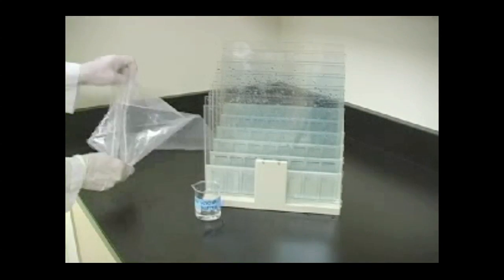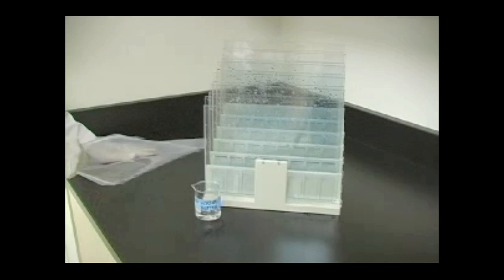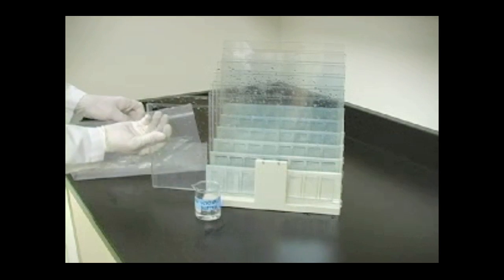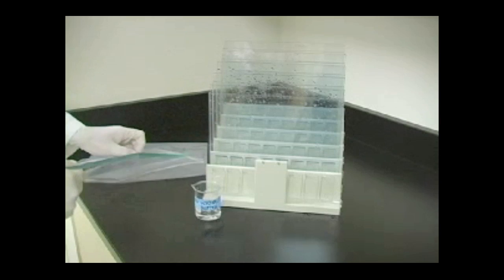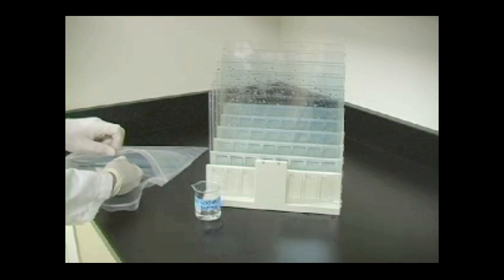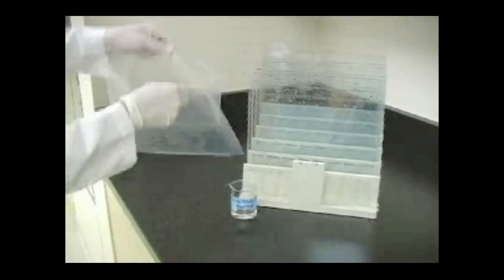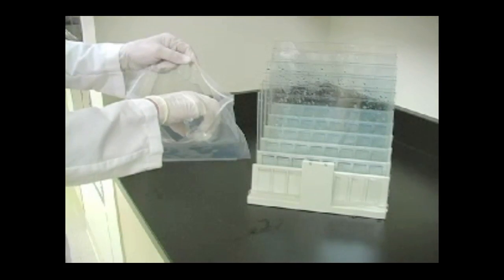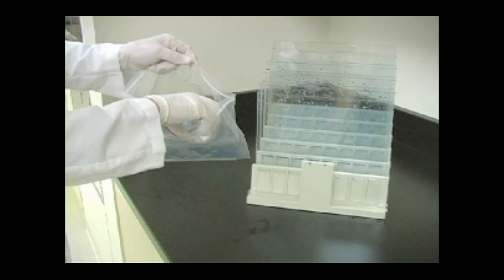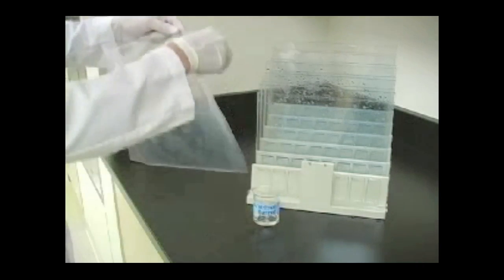The gels are now ready to use. To store, place the gel cassette in a tightly sealed container or ziplock bag. Add a few milliliters of 1x gel buffer to the bottom of the container and to the tops of the gels to prevent them from drying out. Store tightly sealed at 4 degrees Celsius.